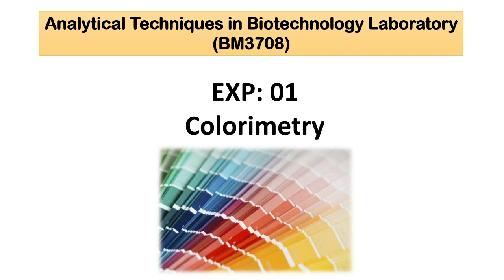Apart from this, we will be doing visible spectroscopy. We will be doing UV visible spectroscopy for solutions, which most of you will need in your next year laboratory experiments when you go for your project.